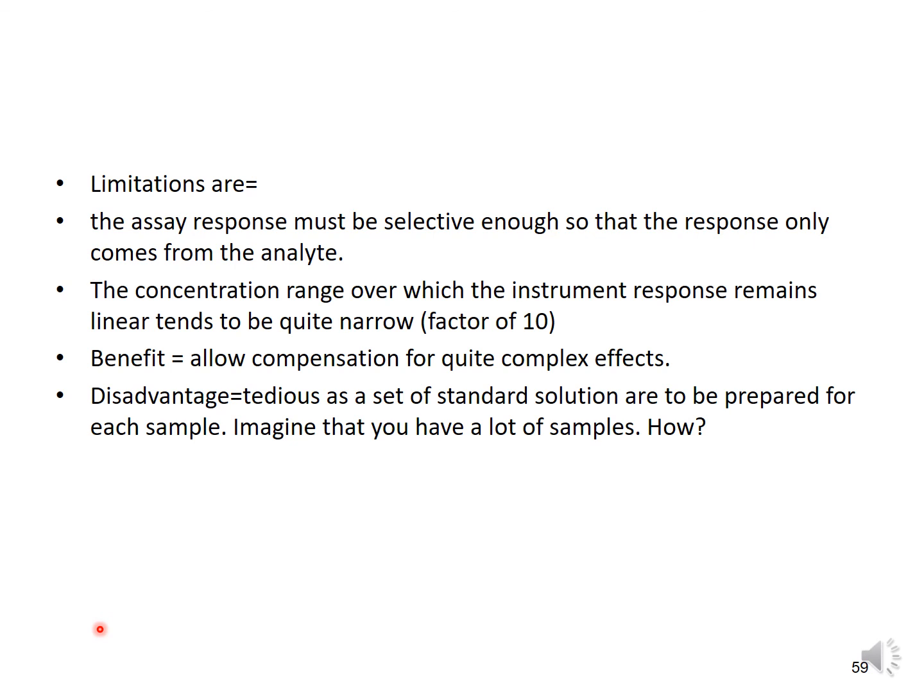And next, the benefit: it allows compensation for quite complex effects. Next is the disadvantage. A tedious set of standard solutions has to be prepared for each sample.